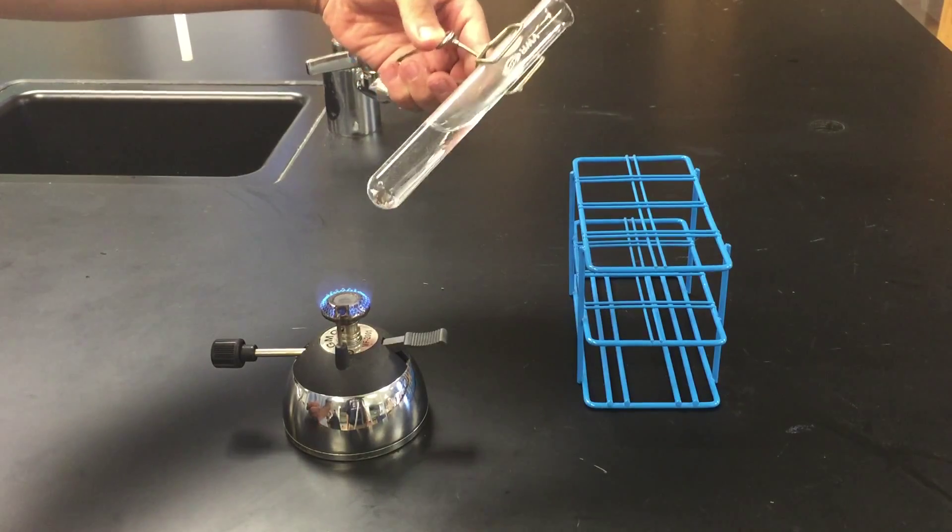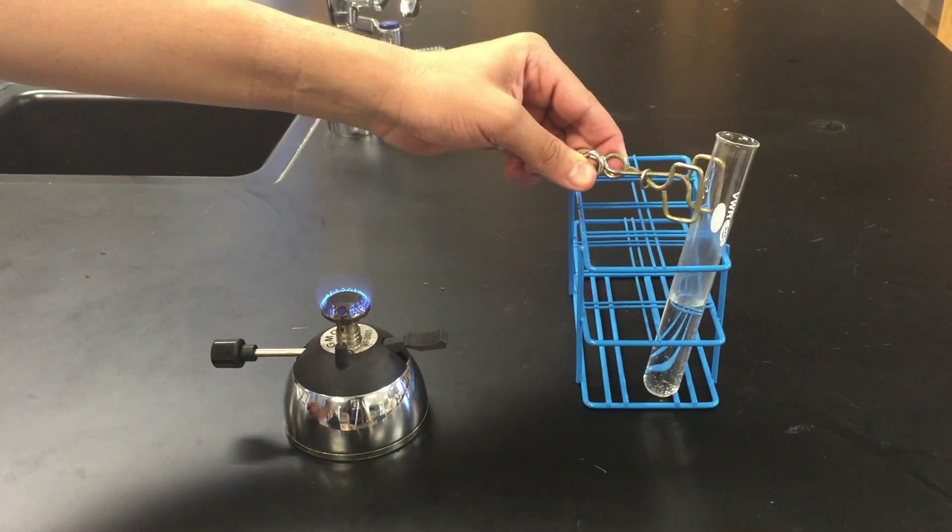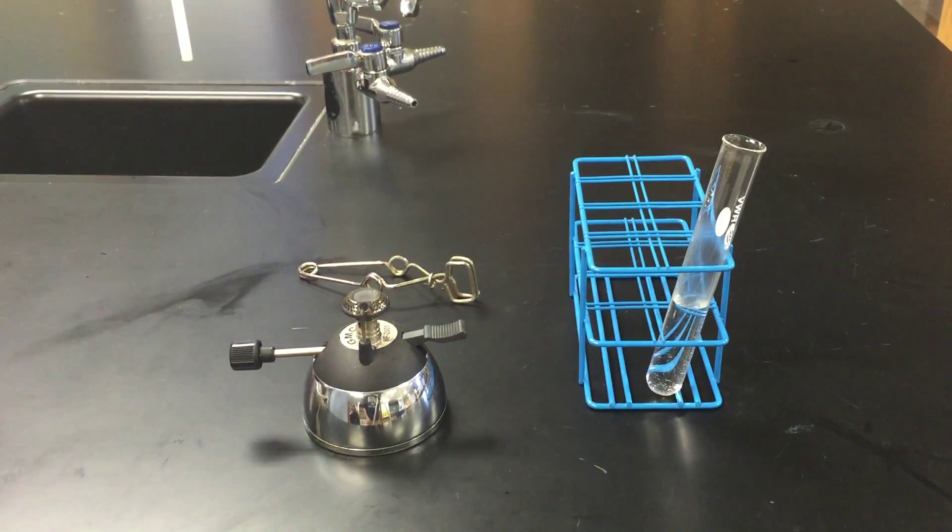Never heat a stoppered test tube. Also, don't immediately cool hot glassware as it could shatter. Turn off the butane burner and put the test tube back in the rack.